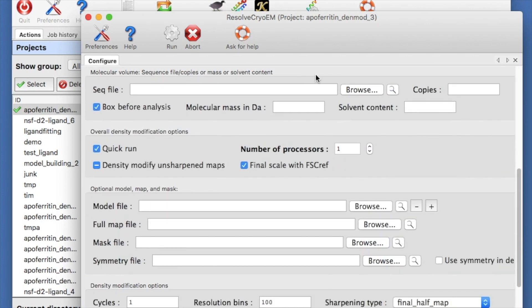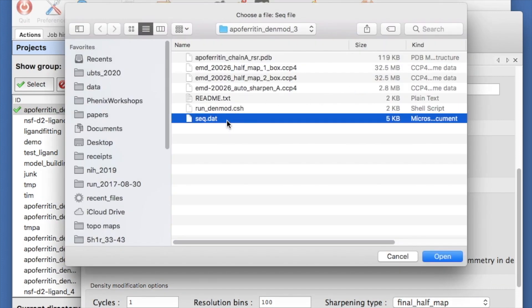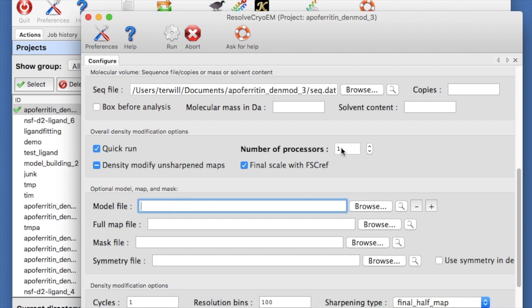Now let's add a sequence file. This tells Resolve Cryo-EM about the size of our molecule. Let's uncheck the box before analysis box because our map is already boxed. Let's use all four of our processors.